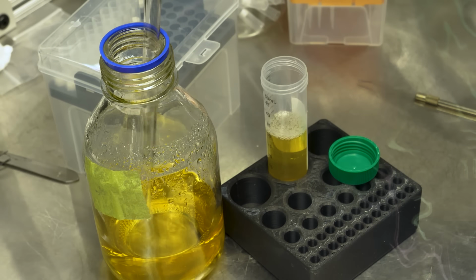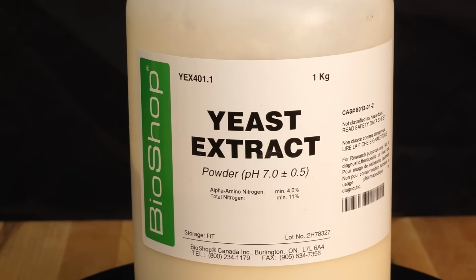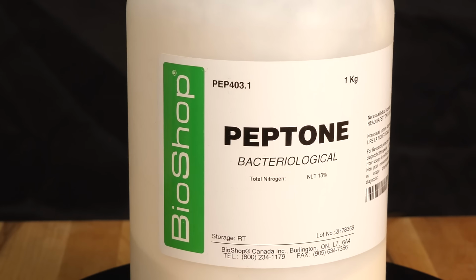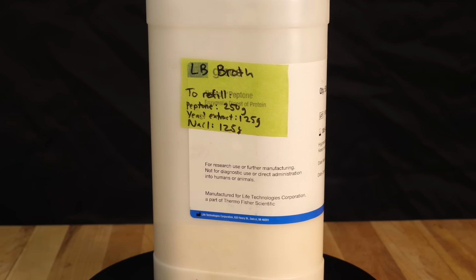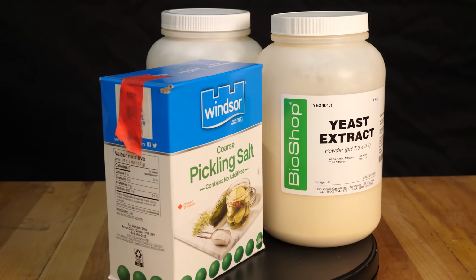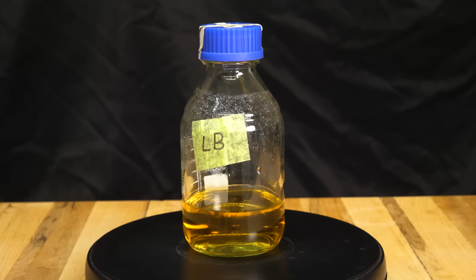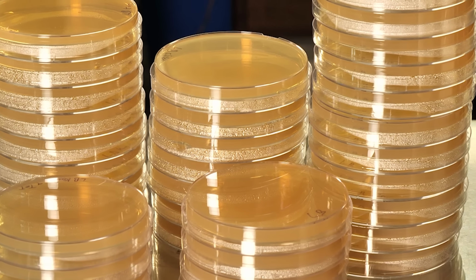The liquid in this tube is called LB, or lysogeny broth. It's a mix of yeast extract and enzymatically digested milk protein called peptone, as well as a little bit of salt to taste. You can either buy this as a pre-mixed powder or buy the individual ingredients and mix it up yourself, which is what I do since it is much cheaper that way. We need it in 2 forms, liquid like this, and then also solidified into plates with the addition of some agar.